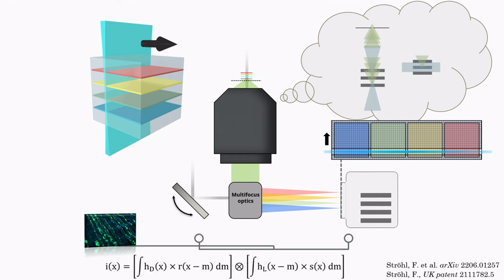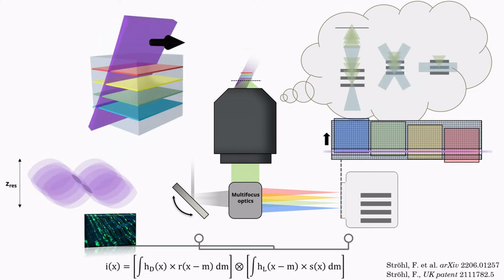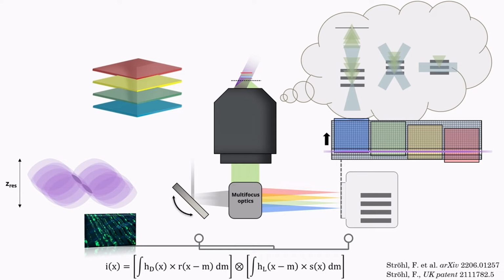If some people here know structured illumination microscopy, you might know that that is a trick you can also use to get additional resolution. And that's exactly what we did by just angling our light sheet a tiny bit. Here's the effect of combining the light sheet along the optic axis. When you tilt it, you get the same effect, but it stretches it along the axial direction. So you actually increase your resolution also along the axial direction with that. And it's optically sectioned.